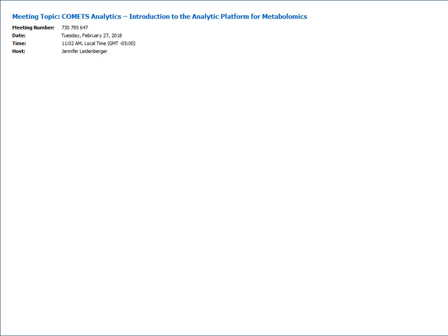Okay, I did get 2 more questions, so I am going to ask those. If people do need to drop off, feel free to drop off. We'll only take these last 2, but I do want to give people the opportunity to get their questions answered. So the next question is, are QC samples like pooled samples or NIST standards used and analyzed in determining quality of data?